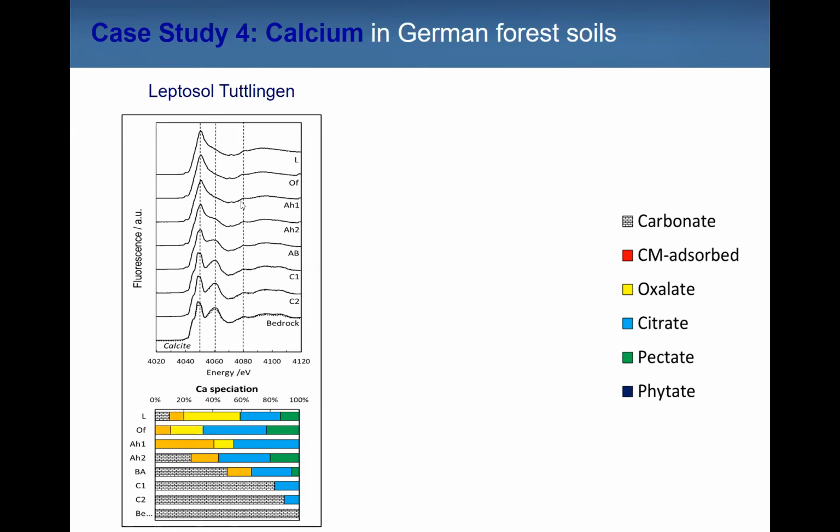Soil formation on limestone means that the limestone is actually dissolved, and there are very small amounts of accessory minerals in the limestone. And these are enriched by the dissolution of the matrix. So you get a so-called carbonate dissolution residuum consisting of clay minerals, iron oxides, and quartz in the topsoil. And the calcium remaining in the soil is here bound to these clay minerals. And you see the percentage of organically bound calcium to total calcium increases strongly when you approach the topsoil.